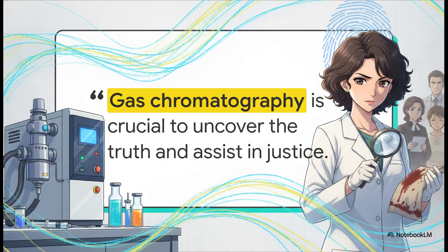And perhaps nowhere are the stakes quite as high as they are in forensic science. Techniques like gas chromatography coupled with mass spectrometry are absolutely crucial for analyzing crime scenes, conducting drug testing, and running toxicology reports. By separating and then undeniably identifying specific compounds in a sample of blood or trace evidence, chromatography provides the hard, physical truth that's needed to solve complex crimes, exonerate the innocent, and ultimately assist in the administration of justice. It's really powerful stuff.